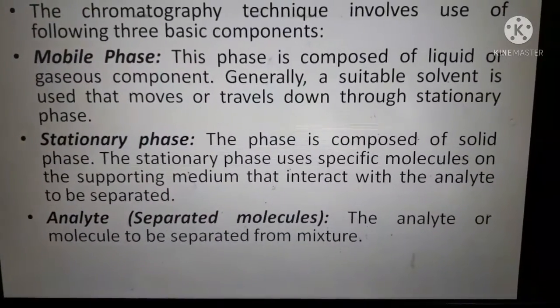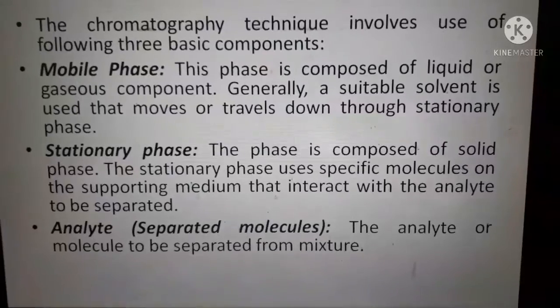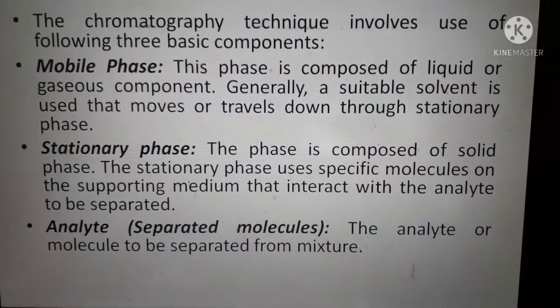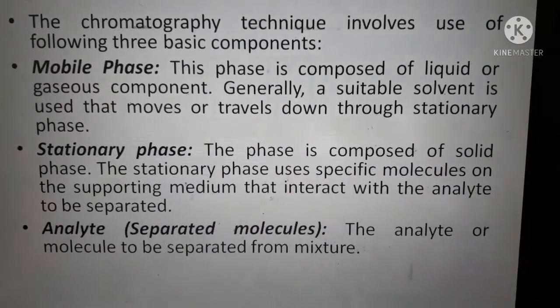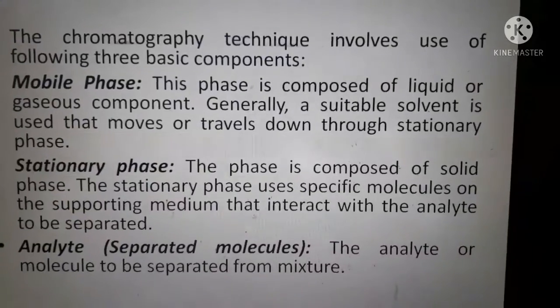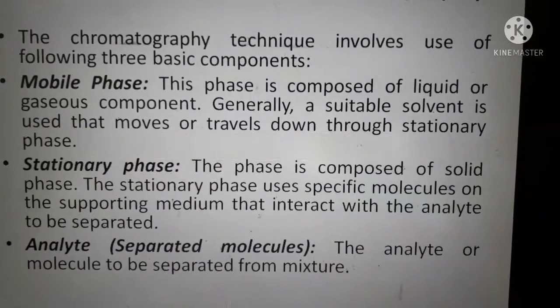So the stationary phase in most cases will be solid in nature, and the last part will be the analyte, the molecule that needs to be separated from the mixture. So this is the very basic of chromatography.